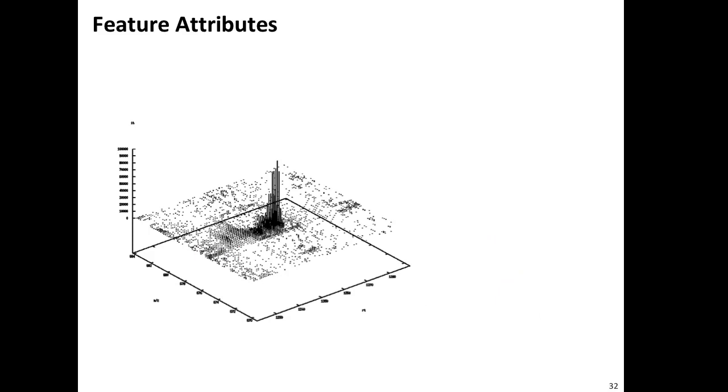What makes a good feature? When you look at this map, you see suddenly it's not that clear-cut anymore. And note that these small excerpts are usually around a 1/1,000,000th of a whole map. This is just a very small excerpt. Obviously, we have some signal here, so this is where we would start to look. But you could argue, well, there's probably something here, and there might be something there.